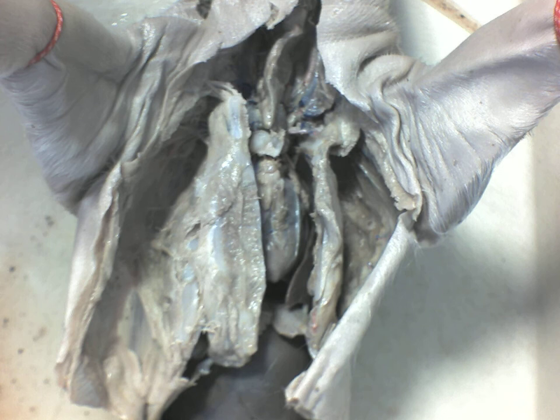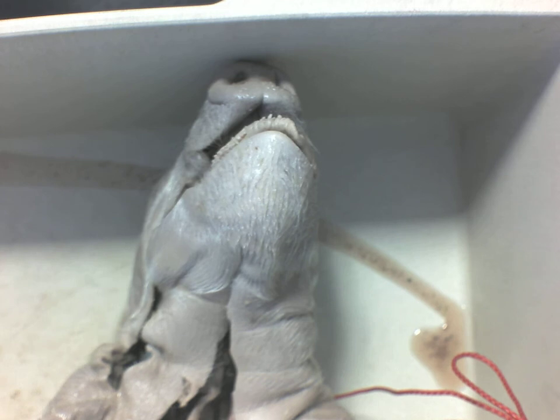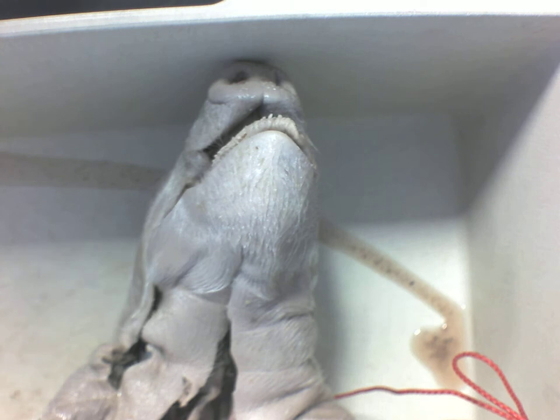All right. I've already pre-dissected the pig, so at least you get an idea about what the digestive path looks like in this organism. If I am going to be talking in a quiz or a test for the pathway that food will take through the digestive system, where is it going to begin? Raise your hand. In the mouth.